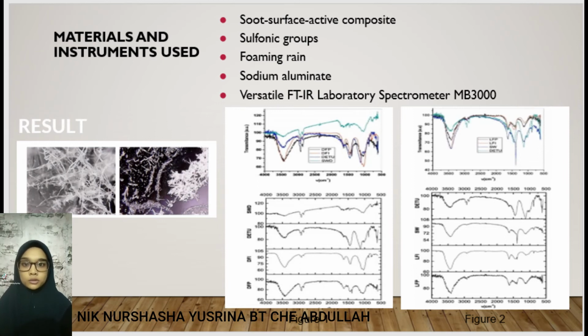Figure 2 shows the compared FTIR spectra of solid continuous phase found on the glass slide after evaporation of water from the liquid, after filtration of rainwater LFI and LFP, and after filtration of liquid resulting from washing the soot with water, SW, and detergent.